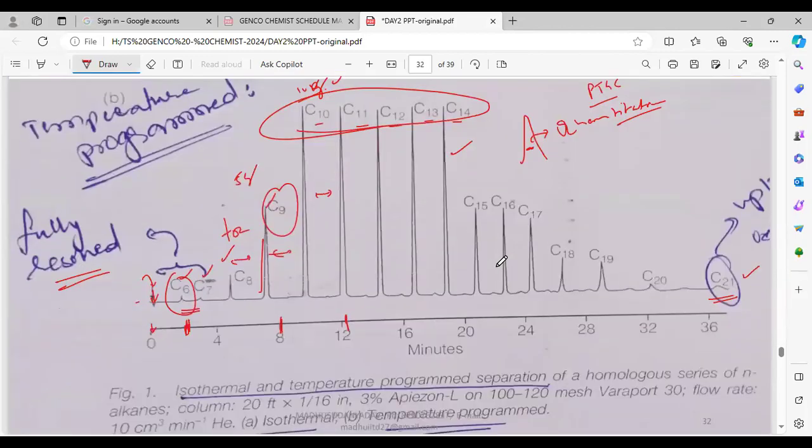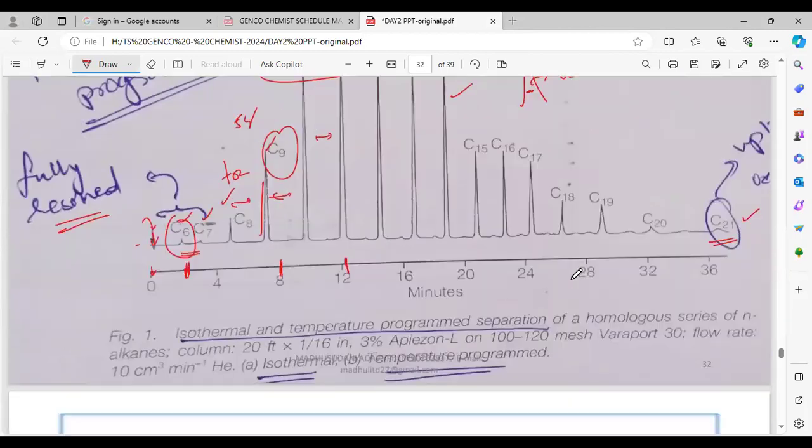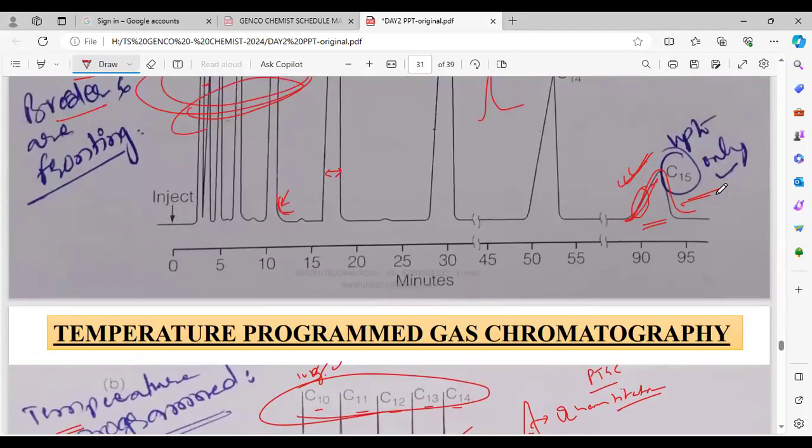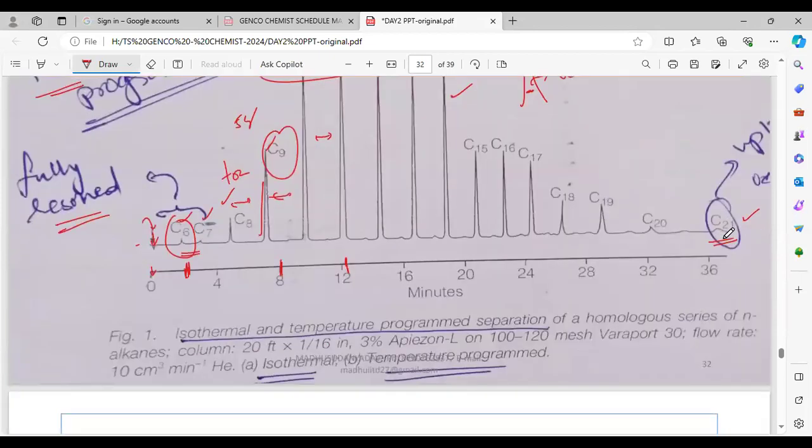ఓకే, సో ఇదండి. సో PTGC చేసినప్పుడు ఏంటంటే స్లోగా టెంపరేచర్ పెరుగుతున్నప్పటికీ ఒక్కొక్క శాంపిల్కి ఒక్కొక్క టెంపరేచర్ దగ్గర వోలటైల్ అవుతుంది, అది స్లోగా బయటపడుతుంది. సో ఈ టెంపరేచర్ గ్రేడియంట్ వల్ల ఏంటంటే సపరేషన్కి ఒక్కో టైంలో సపరేట్ అవుతుంది. కాబట్టి మీకు క్రోమాటోగ్రఫీ అనేది చాలా క్లియర్గా కనబడుతుంది. దిస్ ఈస్ ద మెయిన్ అప్లికేషన్ ఆఫ్ దిస్ టెంపరేచర్ ప్రోగ్రామ్డ్ గ్యాస్ క్రోమాటోగ్రఫీ. దీంట్లో ఉన్న అడ్వాంటేజెస్ ఏంటి? ప్రీవియస్ ఐసోథర్మల్లో ఉన్న డిసడ్వాంటేజెస్ ఏంటంటే, అక్కడ మనం ఓన్లీ C15 వరకే సాల్వ్ చేయగలం, అంటే సపరేషన్. బట్ ఇక్కడ C21 వరకు, అంటే ఇక్కడ ఎఫిషియన్సీ పెరిగినట్టు కదా, డిఫరెంట్ టెంపరేచర్.